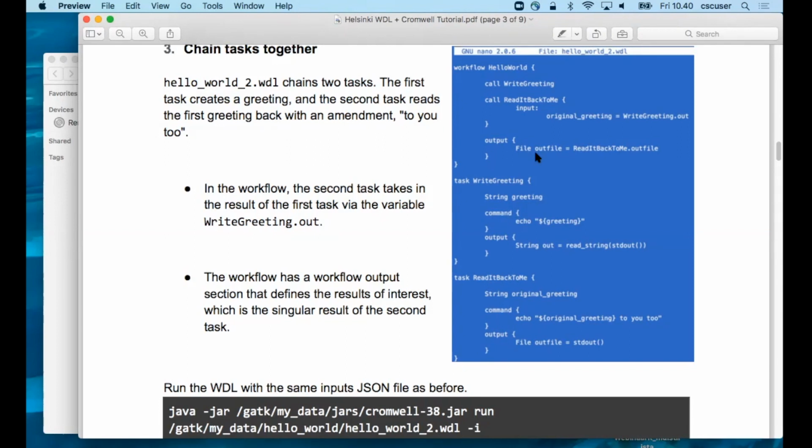They'll still be saved and they'll still be present. But by putting it there specifically, you have access to it and you can see it show up in the final summary and things like that. So it's like saying this output is special and we care about it. The other utilities that track Cromwell will be able to do things with that final output. That's, for example, how Terra knows where to get the final output.